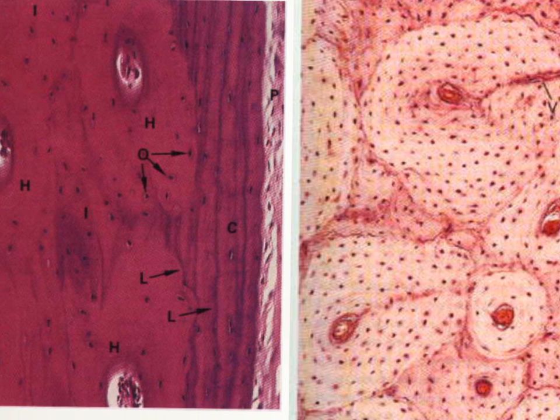As they are present parallel to the outer circumference of the bone, they are called external circumferential lamellae. Here we have the periosteum, and these lamellae parallel to the periosteum are the external circumferential lamellae, while these lamellae are the lamellae of the osteon or Haversian system.